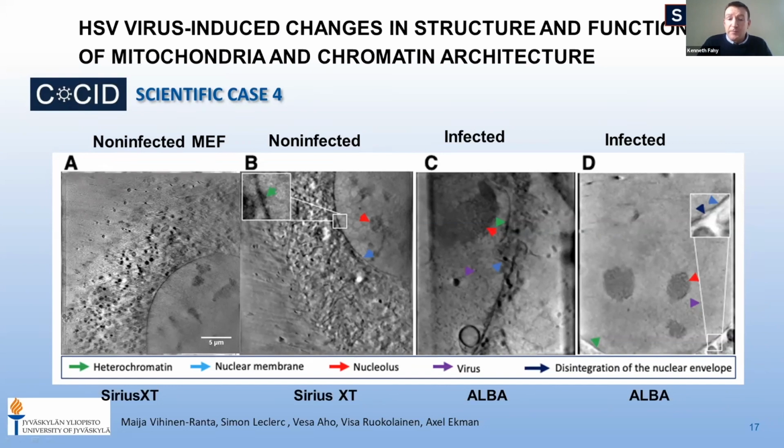We now have herpes virus infected cells in-house, and these are the next steps for us to actually determine the structure of mitochondria during herpes virus infection.